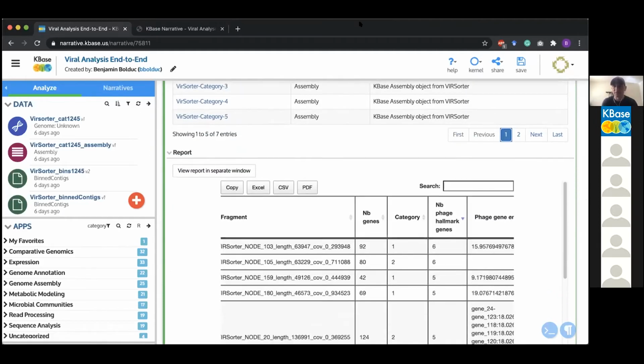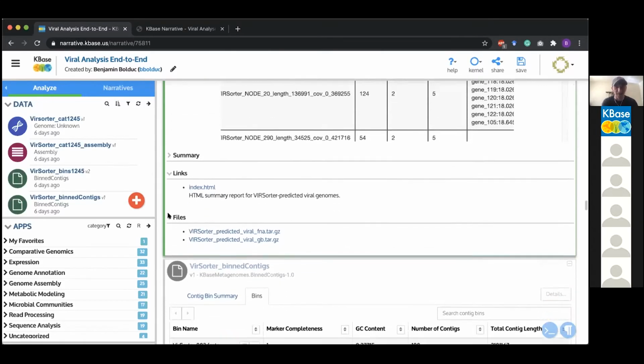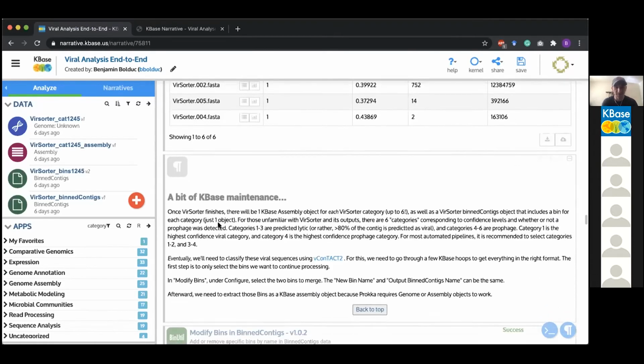Can I just peek over to the chat box just to make sure? Excellent. So awesome that people are answering questions in the chat. Okay, so open the contigs.